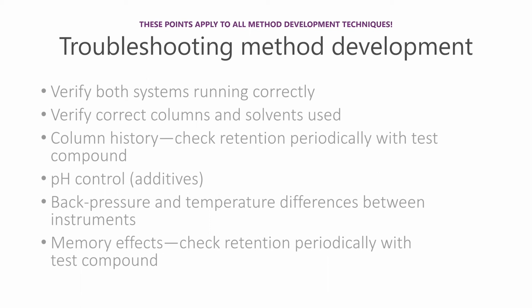Ideally, the temperature and pressure settings should be the same between the analytical and the preparative system. The density of supercritical carbon dioxide is controlled by temperature and pressure. Higher density causes early elution of compounds.